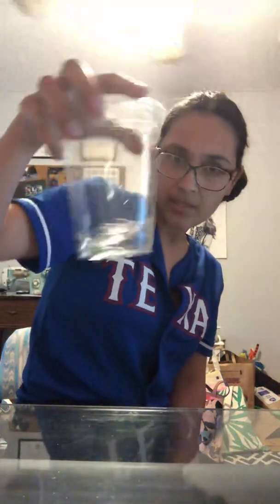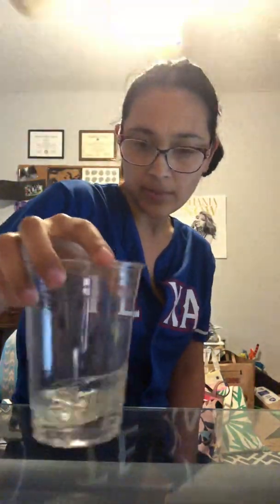It's very slight, not a big color change. But for the third column, for citric acid and vinegar, I would say temperature decrease. It did get colder. The crystals dissolved, and it's a pale yellow color. It looks very clear though, but it did change a little bit of color to yellow.